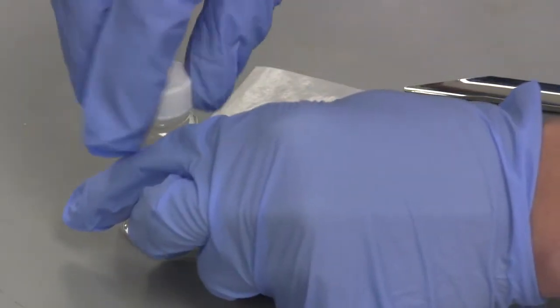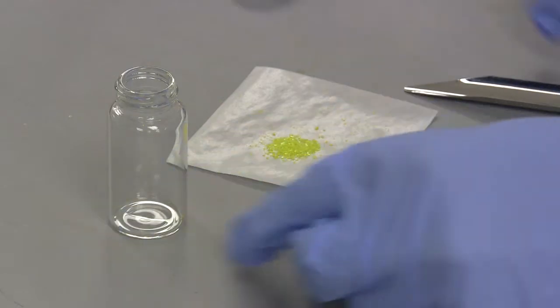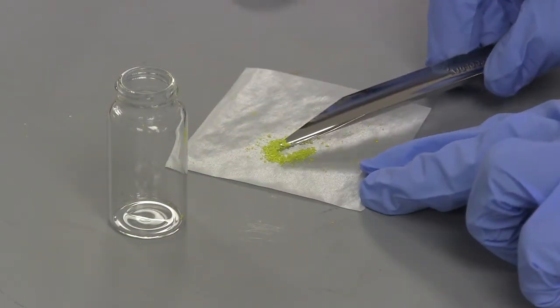Prepare the sample by placing a very small amount of product into the scintillation vial. Solid samples should be smaller than a pinhead.